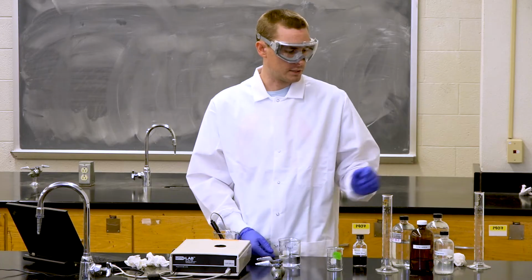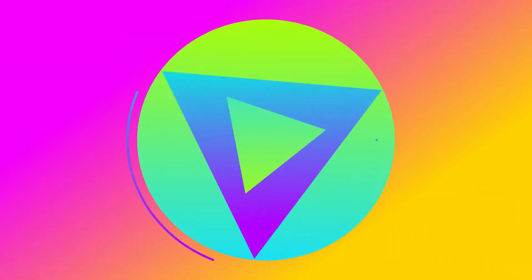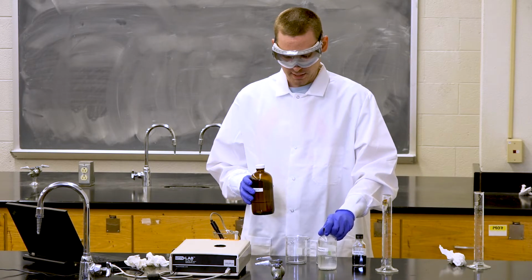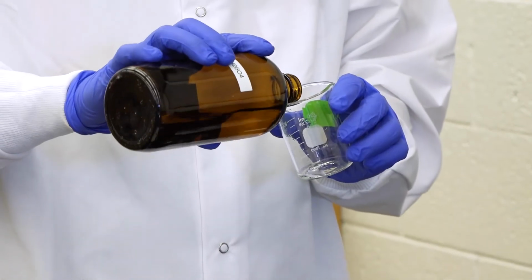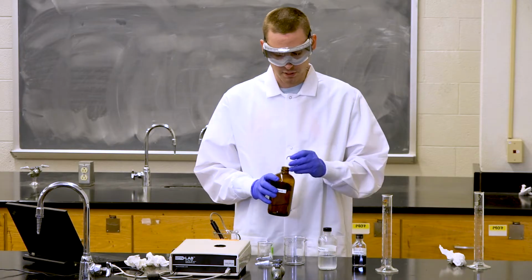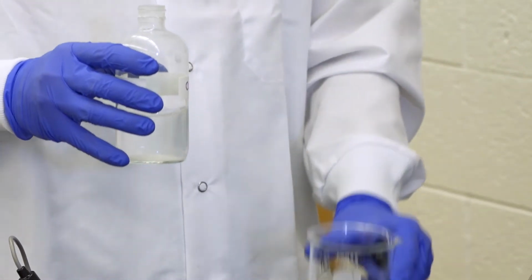We will now move on to our sulfuric acid and barium hydroxide using our indicator. So first, we're going to measure the conductivity of these solutions by themselves. So you'll need to add some sulfuric acid to a beaker, enough to cover the bottom of the conductivity meter or probe, and then you'll want to add some barium hydroxide, about the same amount, to another beaker.